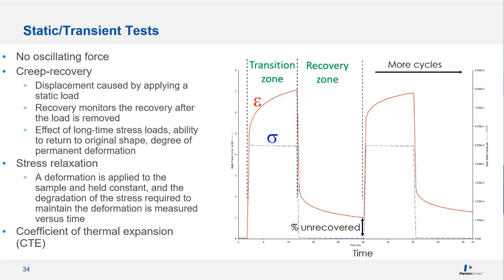You can do this in many cycles at room temperature or as you increase the temperature. Creep recovery tests allow us to study the effect of long-time stress loads, fatigue, ability to return to original shape, and degree of permanent deformation.